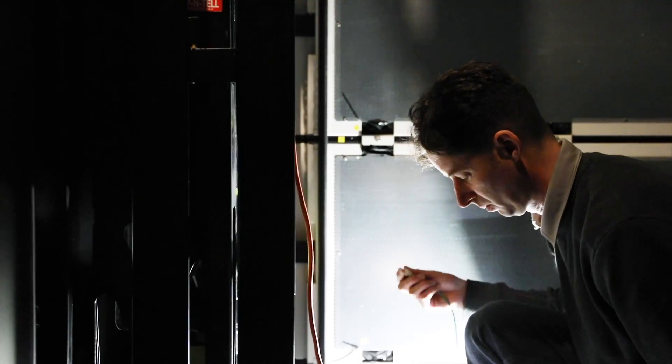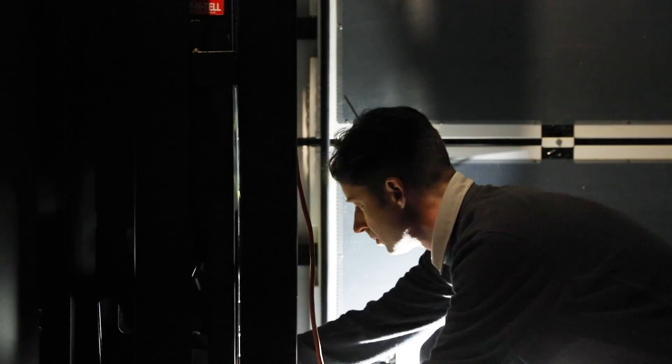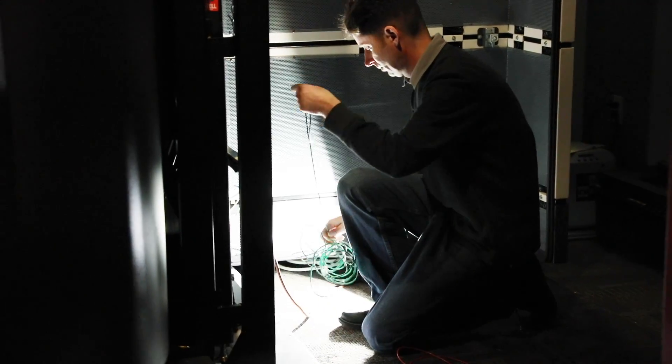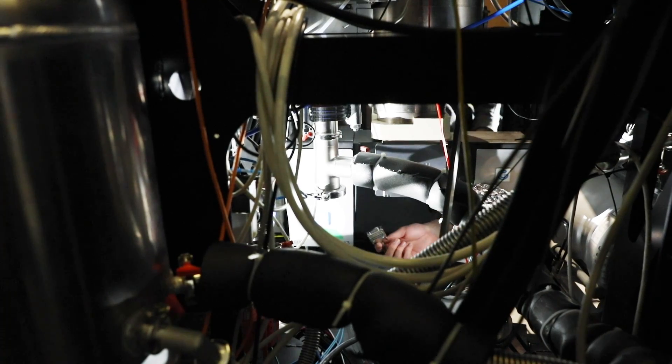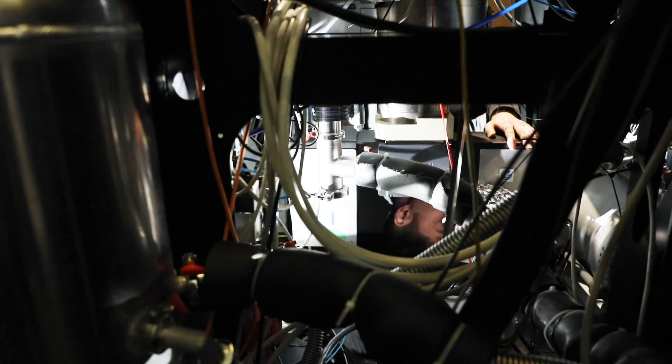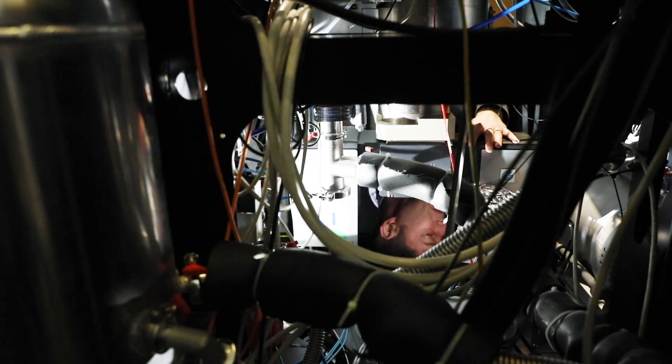Right now, the way that we run electron microscopes, we run them such that we throw away a lot of the scattered electrons because our detectors are too slow. So we decided to go to the absolute extreme and just try to capture every electron, capture all the scattered electrons we can and maximize the signal and noise. It means you get the most out of your sample before you eventually destroy it.